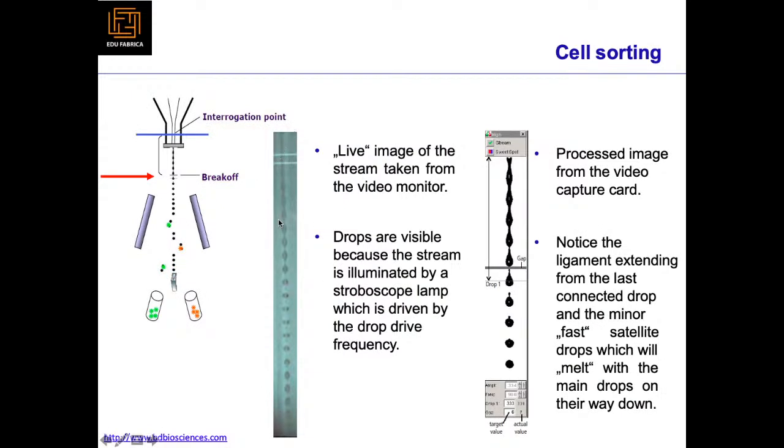Your single stream is changing into these droplets. That's how they are being separated, and then at the end, with the help of these deflectors, we can direct them into two different spots.